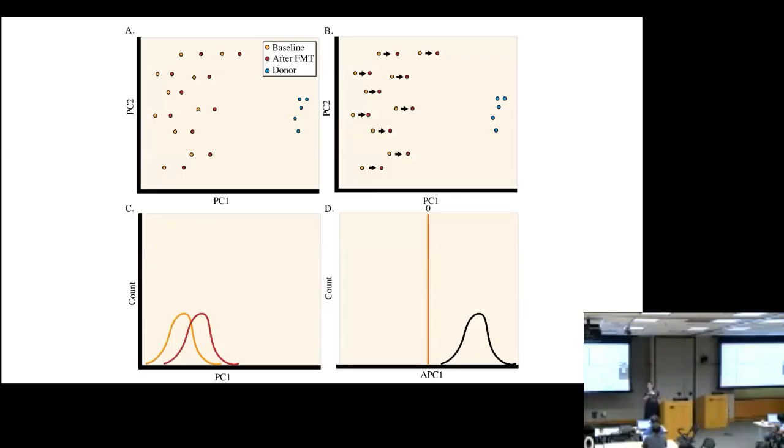And this is just a slide to show how important it is to use the right tools. I really like this. It's adapted from, I can't remember the journal. Do you remember the journal? Microbe. Okay, yeah. So I adapted this from Microbe.